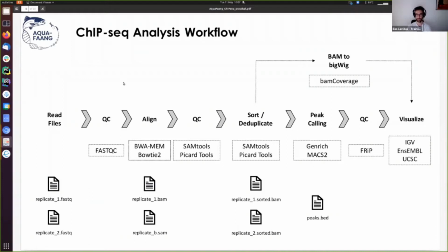So let's take a look into every step of this. In the beginning, the early steps are going to be hands-off for you. But after the middle point of this workflow, you are going to get hands-on with our data.